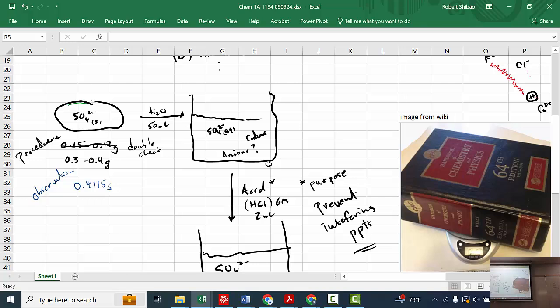Okay, once this is cooled down a little bit, it doesn't take that much time. You know, it could still be warm. I'm going to take this out and then cover it like this. I can handle this with my fingers. The reason I can handle this with my fingers is I'm not going to weigh this. It says to weigh the weighing bottle. Don't bother weighing the weighing bottle. We don't need to know how much it weighs. Also, don't bother weighing the beaker. We don't need to know how much it weighs.